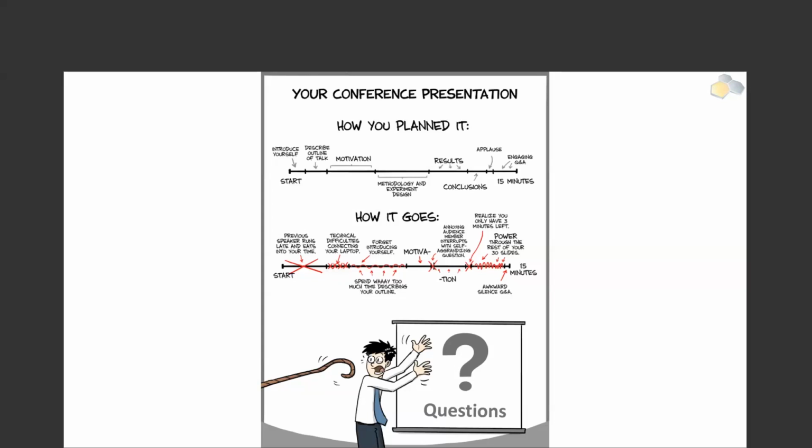More questions? Actually, I'm going to put the questions up, or I can read the questions to you. Or you can read them also, right? Please go ahead. One says here: there is a means of identifying and quantifying DVGs and maybe even quasispecies. Is there any sort of scientific working group that addresses how to interpret these? Also, assuming we also wanted SNV analysis, is that done by Hexagon?